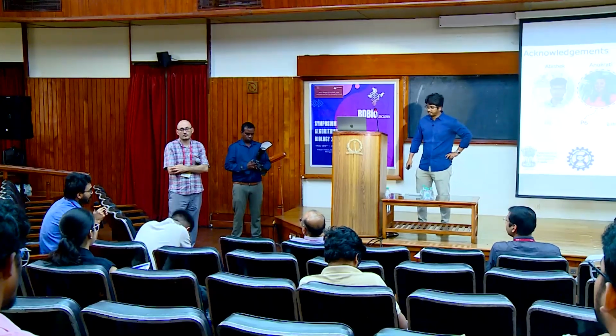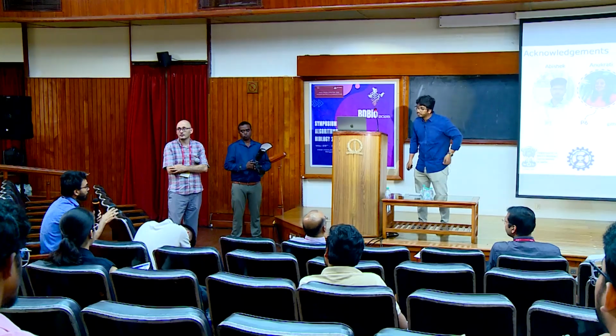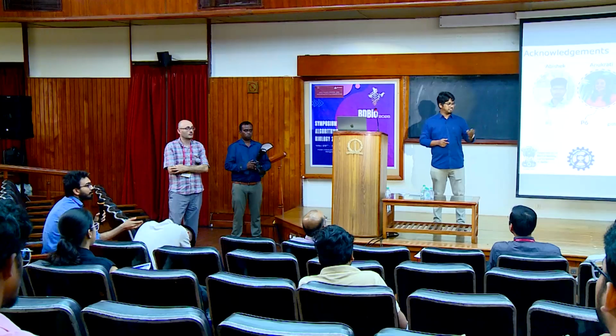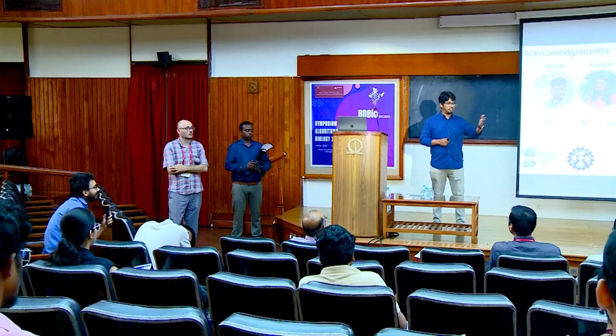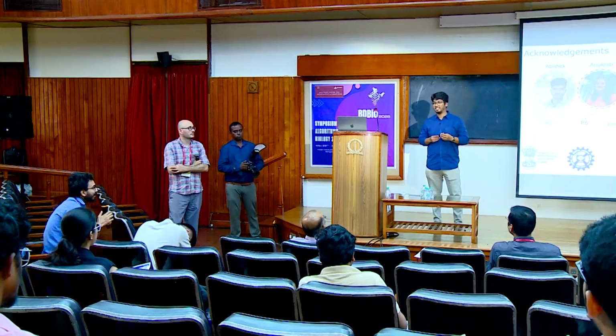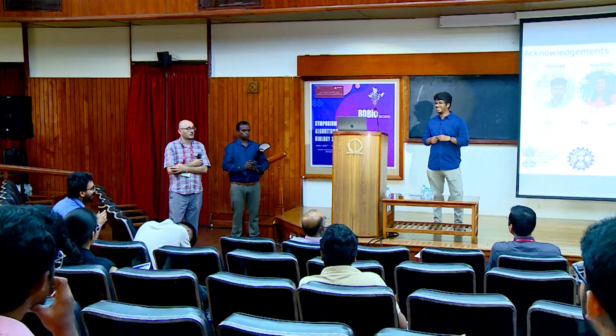Yeah. And did you have this part wherein you are doing error correction before doing any sort of analysis? We have not tried that, but that's an interesting strategy. I was talking to him, and I said now there is better homopolymer performance. I think I will try that out. Okay, and do you think it will improve the accuracy? That's the hope. Yeah. Okay. Thanks.